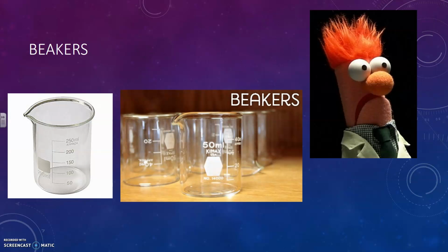Beakers. So, the joke here is that this Muppet, his name is Beaker because he's a scientist. Me, me, me, me, me, me.